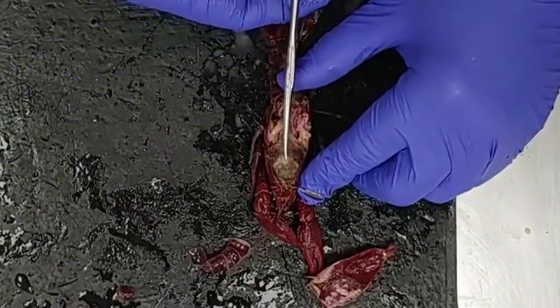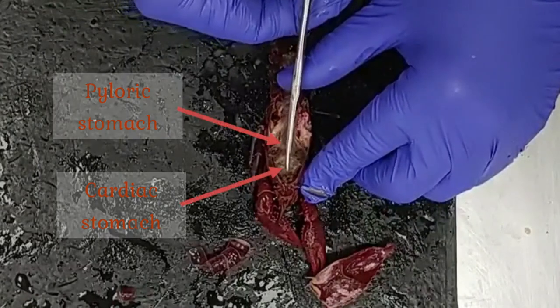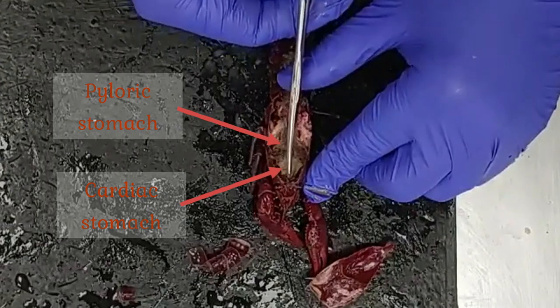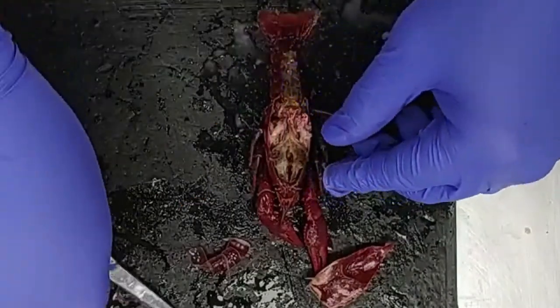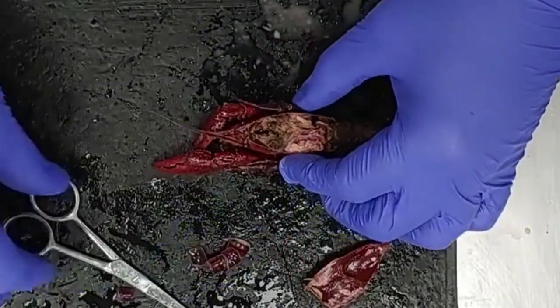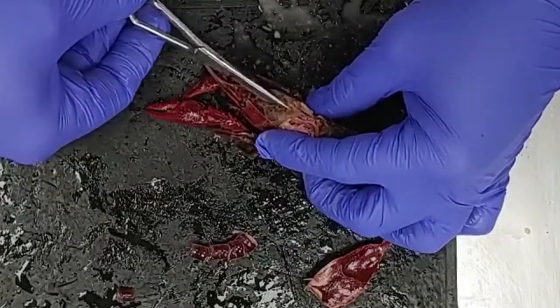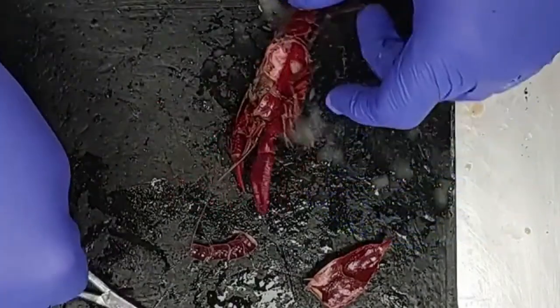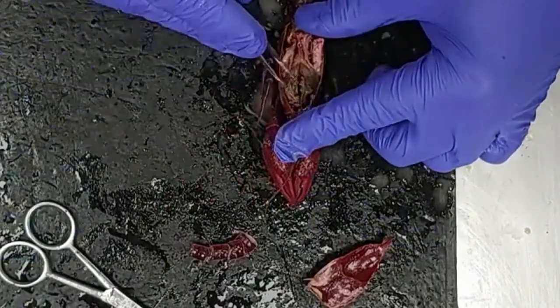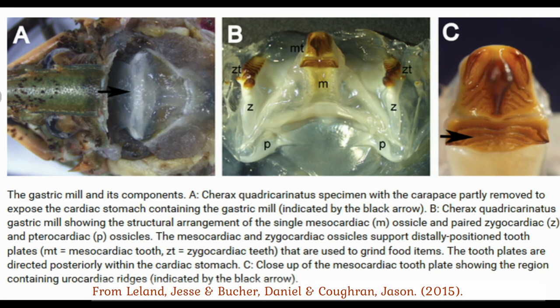Now we're actually going to open up those stomachs, because the contents are more interesting than you might expect. You might think you'll find the crayfish's last meal or an empty space — but no, inside you're actually going to find chewing structures called the gastric mill: little chitinous teeth. So you thought you were done with mouthparts, but hidden here in the stomach, the crayfish has a surprise for you. The gastric mill is composed of three chitinous teeth that come together to chew up food as it passes from the cardiac stomach into the pyloric stomach.